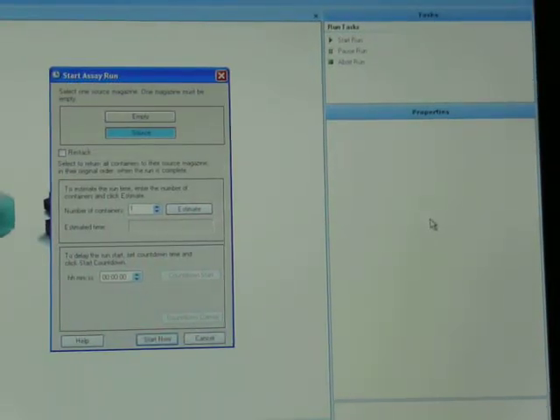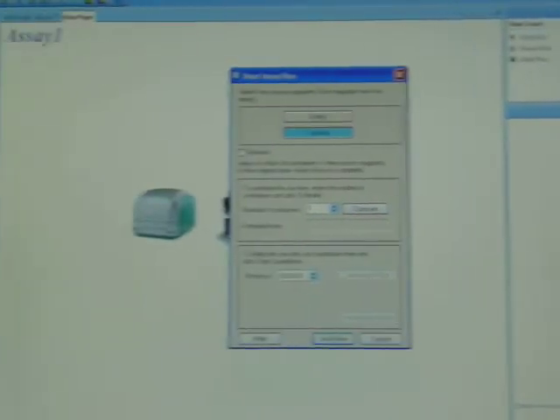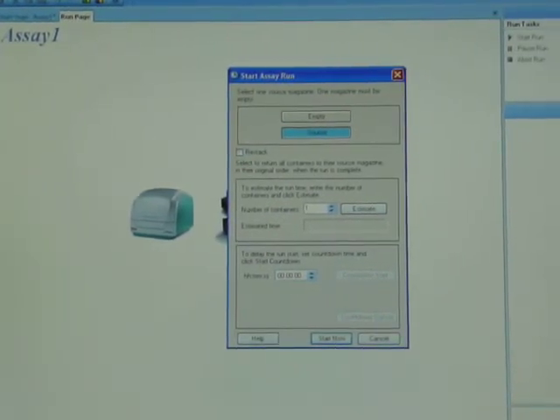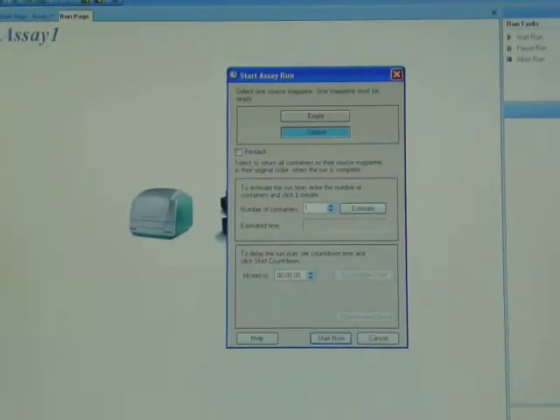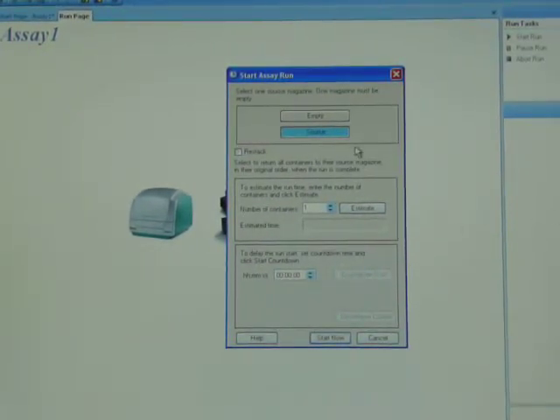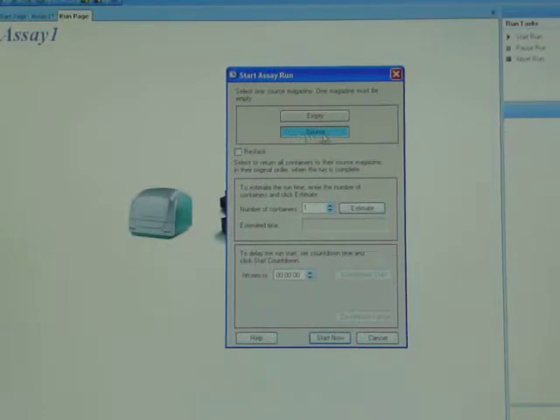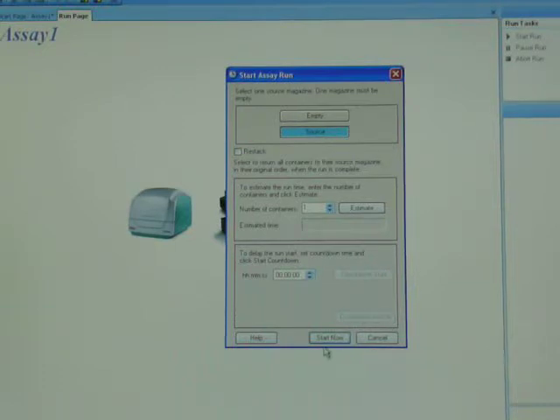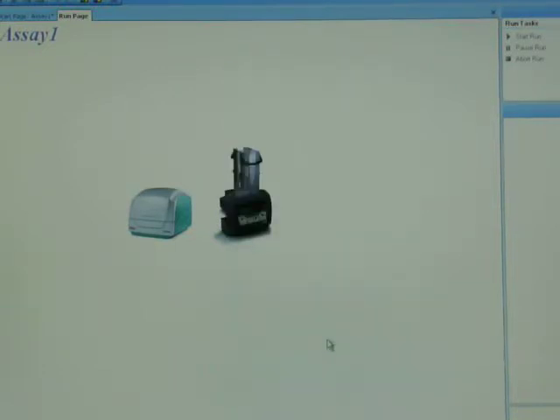I'm going to pan over to the center of the screen. This is the start assay run dialog. It shows you that plates are in the source or the front stack, empty stacks are in the back. All I have to do is click on the start now button.